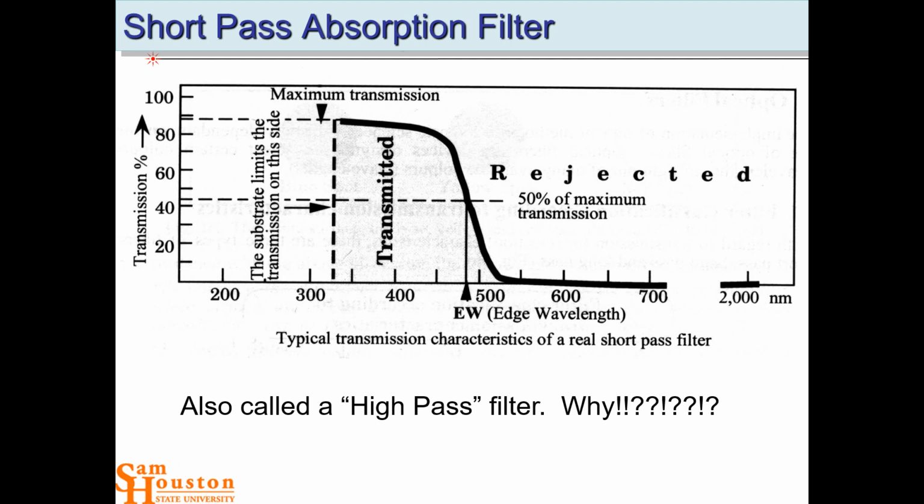So why would that be a high-pass filter? Look at the spectrum and explain to me why it's a high-pass filter. What does the word high mean in this context? High energy, or frequency.